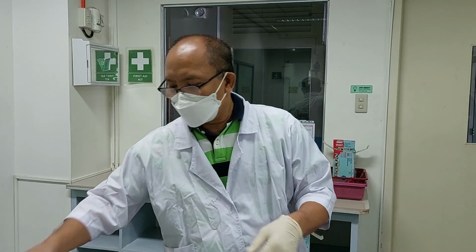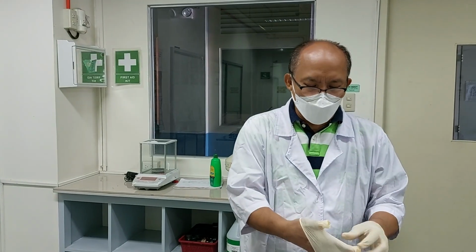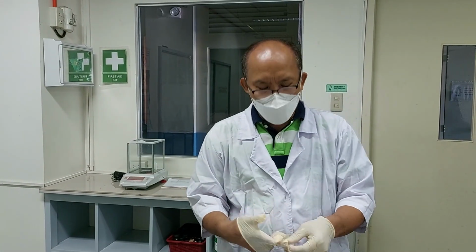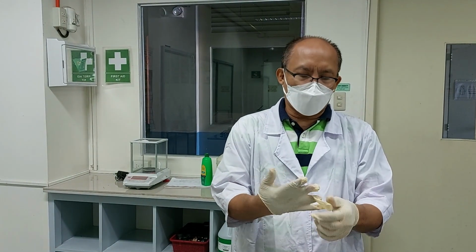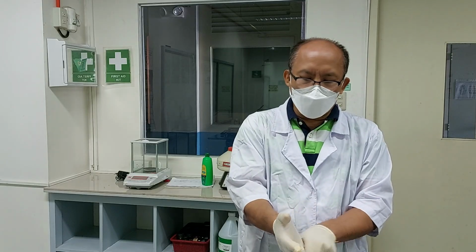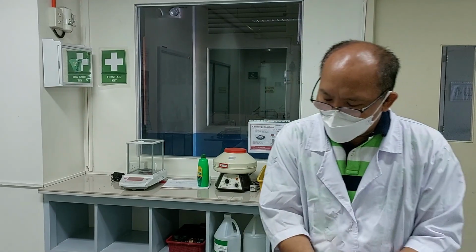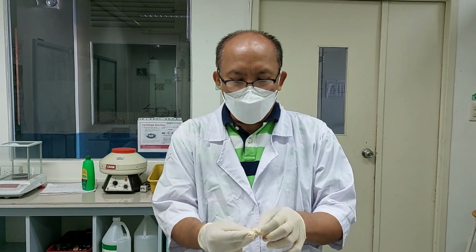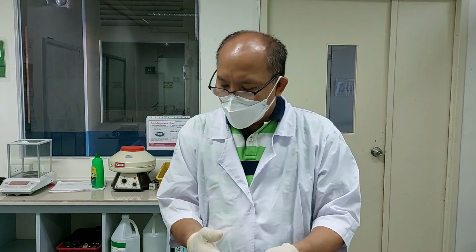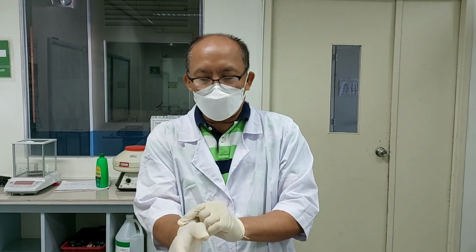So when the color of bromine disappears, it means your unknown compound is either an alkene or alkyne. Aromatic will not undergo electrophilic addition reaction, so the color of bromine will remain the same. That is how you are going to differentiate aromatic from alkene and alkyne. So in our experiment, we have our acetylene to represent the unsaturated hydrocarbon alkyne, and then benzene for aromatic. And let's see the difference in the reaction.